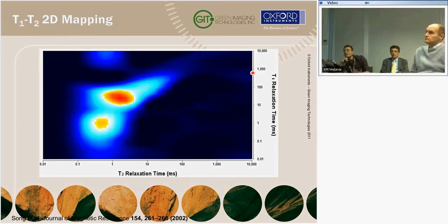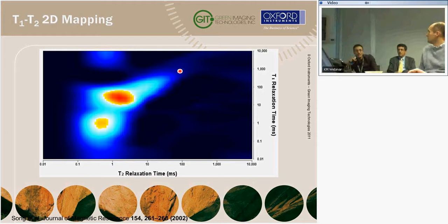And since we often log with a short TE, short echo spacing, about 0.2 milliseconds, the duration of the gas signal will hopefully be restricted. So I should expect that the gas will stay in the right of the up here.